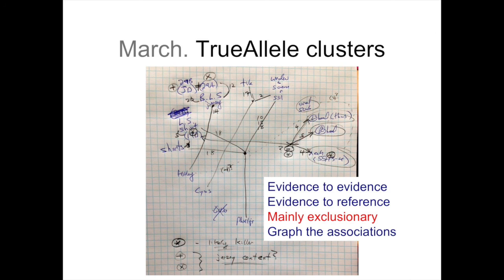Of all the different clusters, Nick is not associated with the fingernails or any of the other parts of the victim's body, but there is an association between the different parts of the body and the victim's own shirt. So his neck and his hands, his thumb, they're all associated. That's this cluster here. And it's either the case that this is an artifact of the victim's own profile, or it's actually another person who's there.